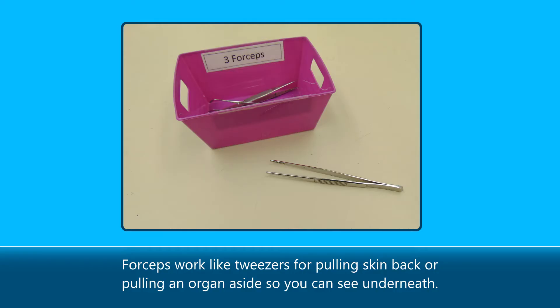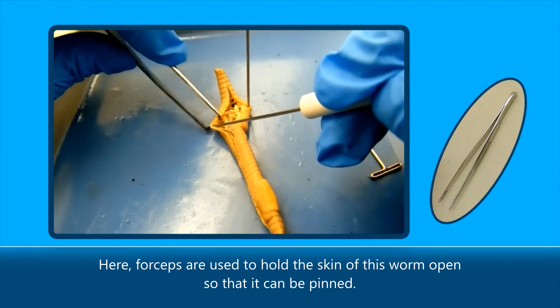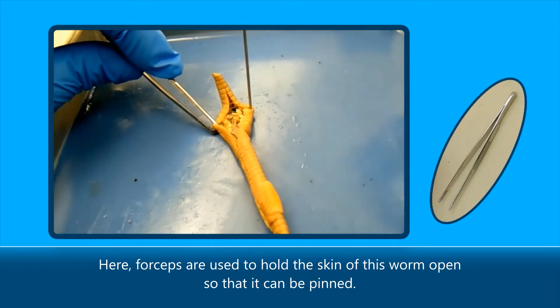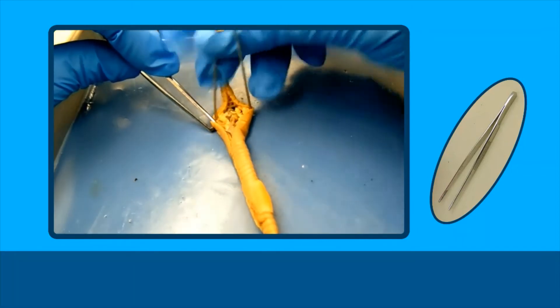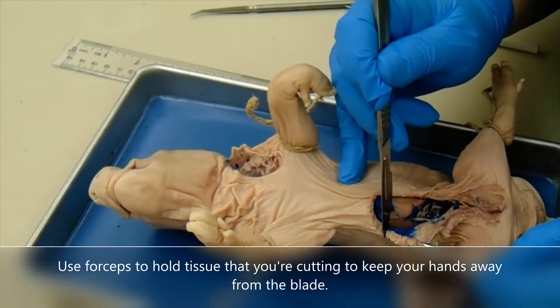Forceps work like tweezers for pulling skin back or pulling an organ aside so you can see underneath. Here, forceps are used to hold the skin of this worm open so that it can be pinned. Use forceps to hold tissue that you're cutting to keep your hands away from the blade.